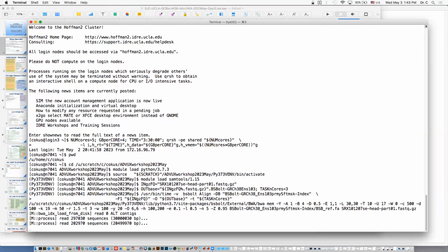Oh, there we go. Now we're actually reading input reads and stuff. So now we're actually working. Yeah, anyway, so there was maybe two pauses there. Maybe one was reading half the strands and the other was reading the other half of the strands. Anyway.